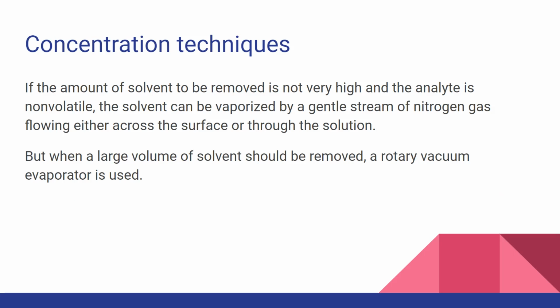The concentration techniques. If the amount of solvent to be removed is not very high and the analyte is non-volatile, the solvent can be vaporized by a gentle stream of nitrogen gas flowing either across the surface or through the solution.